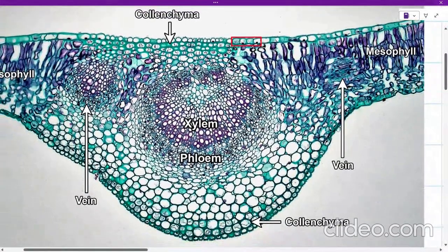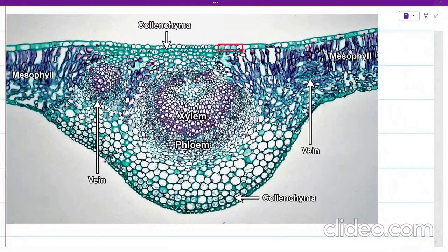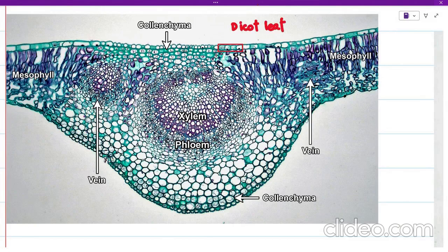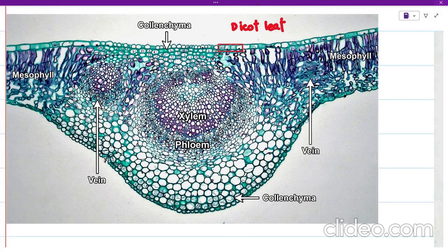The first slide we have is about the dicot leaf. The examiner will usually require you to first make the plan diagram of this, and then in part B they will ask you to select a group of four or five cells. They will ask about individual cells — it can be from the epidermis or cells near to the epidermis. This is the 10x view used to draw the plan diagram.